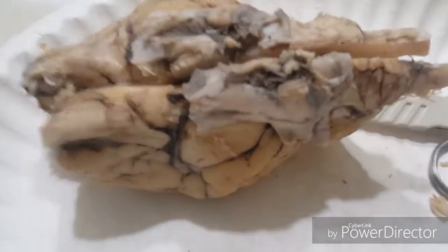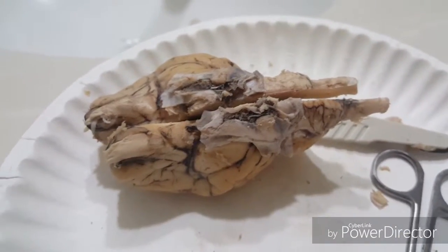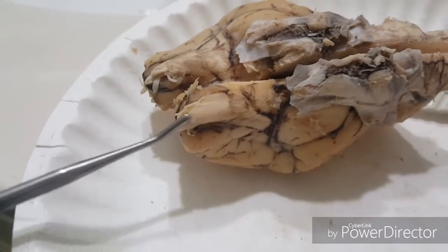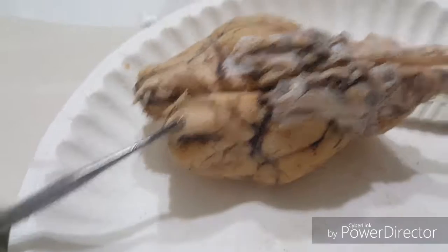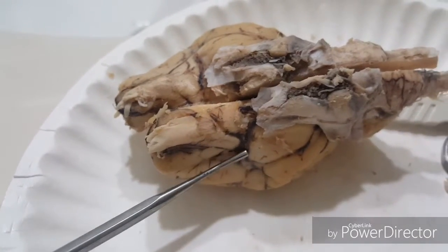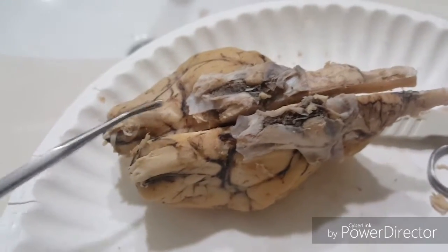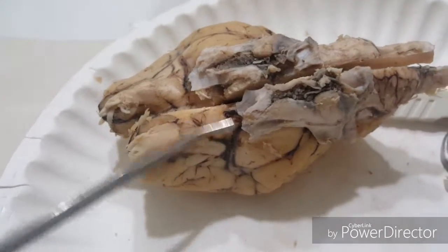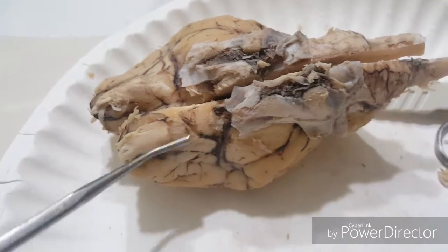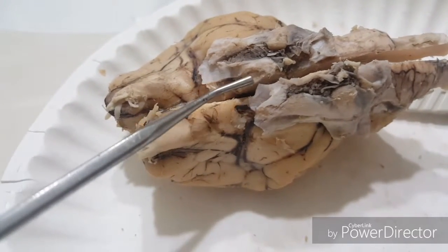So next we're going to look at some structures from the ventral view. We're going to start with the olfactory bulb, which we can see right here. The olfactory bulb runs into the brain with the olfactory tract. Then we cross to the optic chiasma, which would have been this X structure that's right here. You can see part of it, but it got cut during the dissection. And then we can also see the mammillary bodies, which are right here.